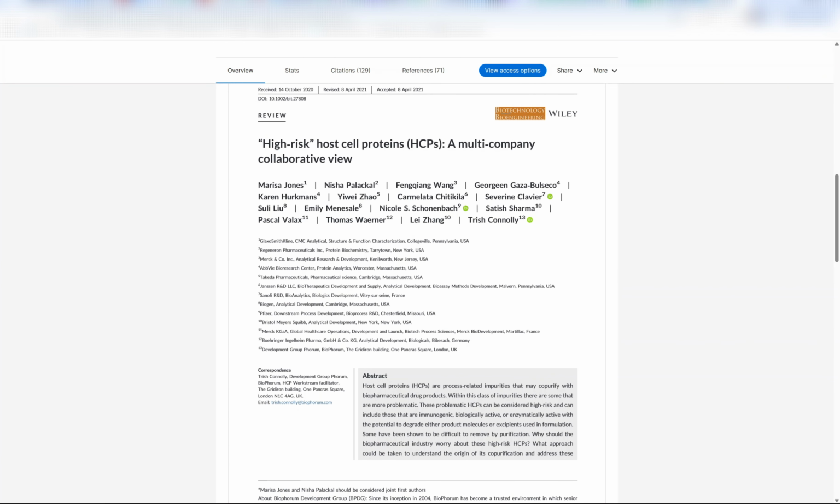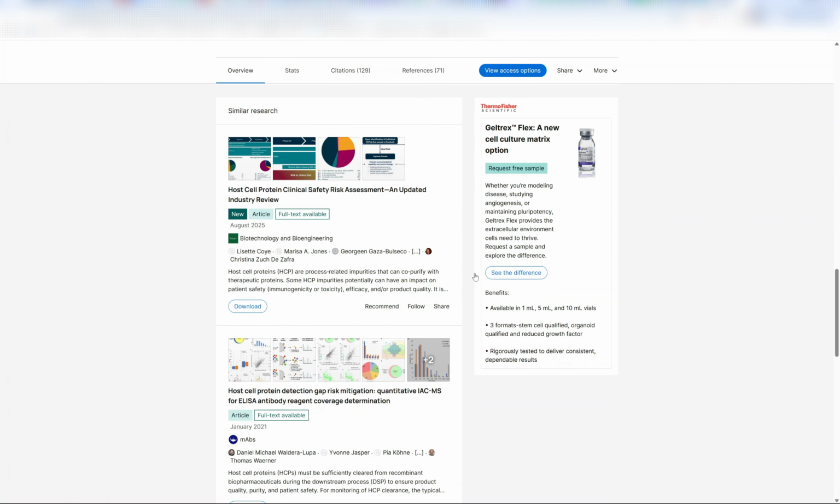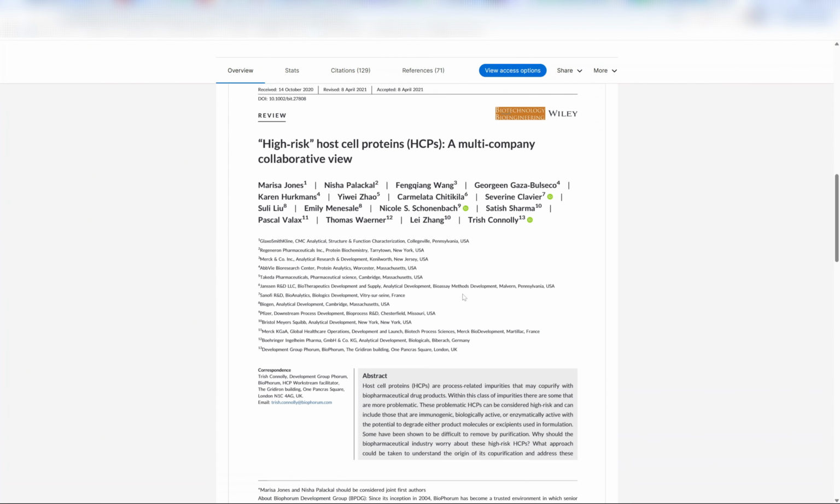So that brings me through to basically this foundational paper of host cell protein analysis within the industry. Now, the vast majority of people that are probably interested in this product or are watching this video will have read this paper, and a lot are still using this paper as the gold standard for host cell protein risk management and identification, even though it was published 4 years ago. This is what's colloquially known in the industry as the BioPhorum HCP paper, or the BioPhorum HCP database. It has been updated since then, and you can find the free version of the database on their website, but that is no longer being updated.